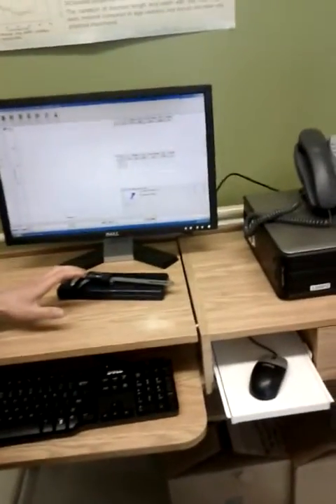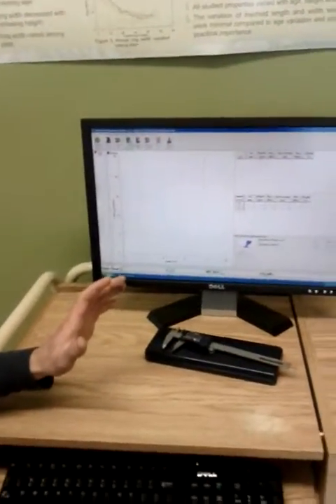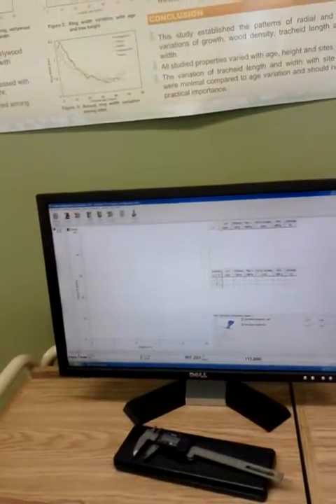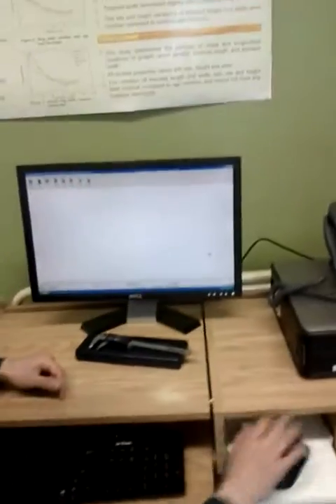I'm ready to begin. So I just press start. Maybe I forgot something. I don't think so. You should wear glasses.